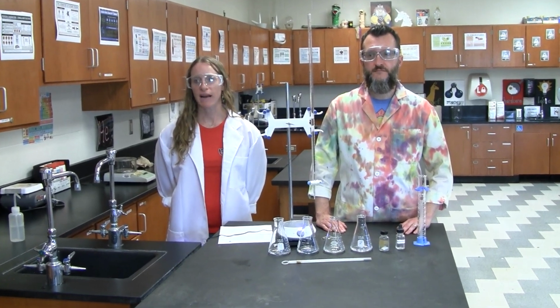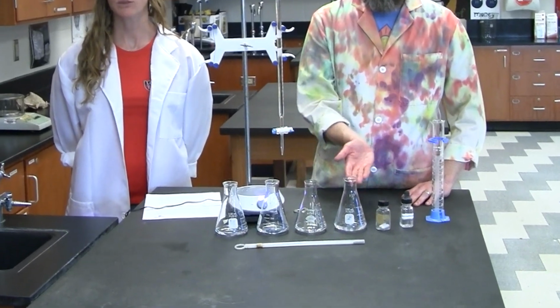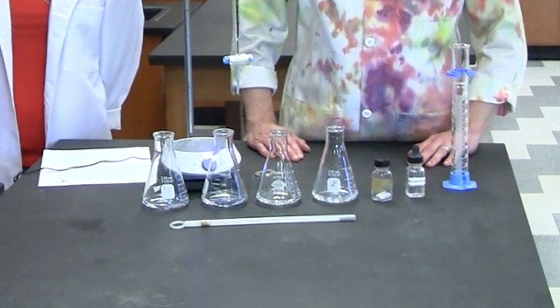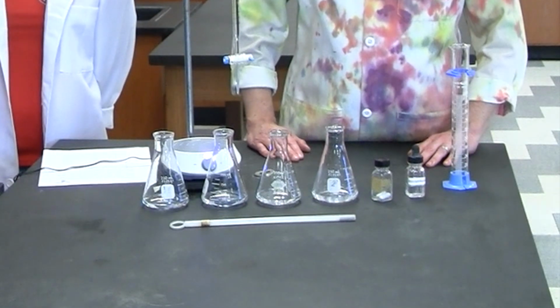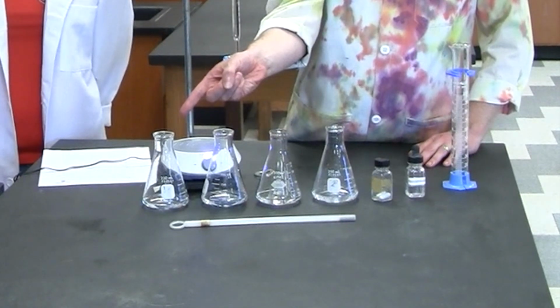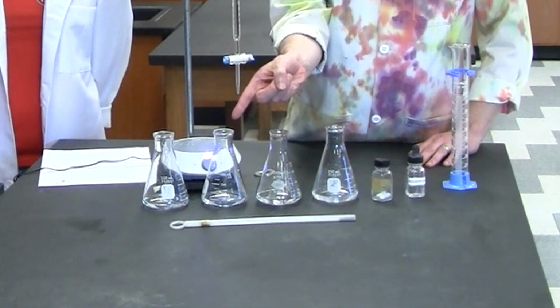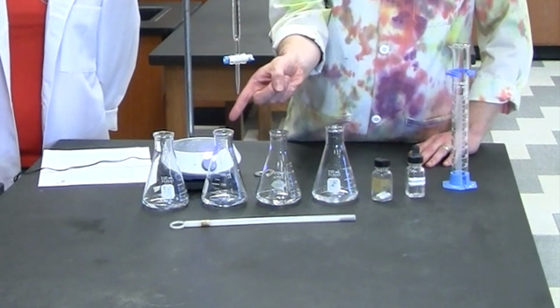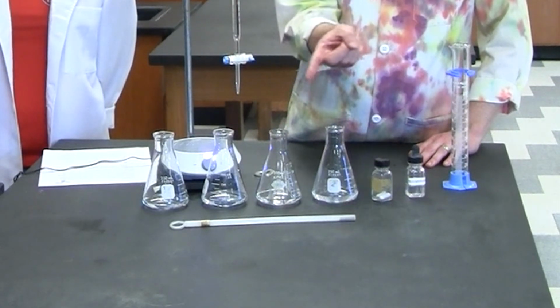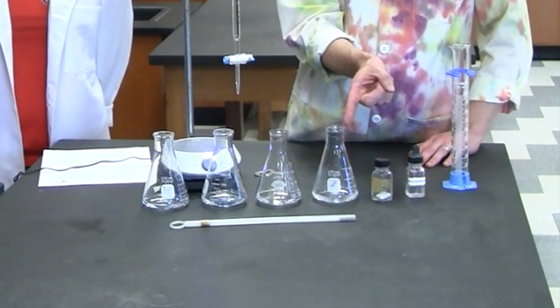The molarity of the NaOH is 0.97 molar. In the 4 flasks, we've added different amounts of vinegar and 25 milliliters of tap water. In the VA column on the left of your data table, record the volumes. Flask 1 is 5.10 milliliters. Flask 2 is 6.30 milliliters. Flask 3 is 7.40 milliliters, and Flask 4 is 8.90 milliliters.